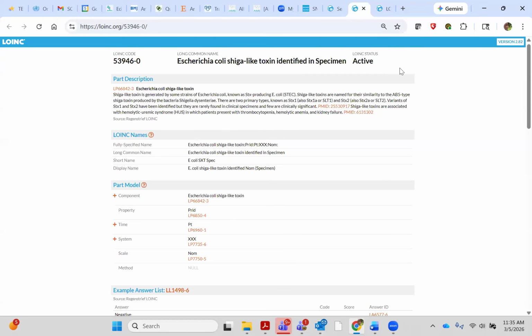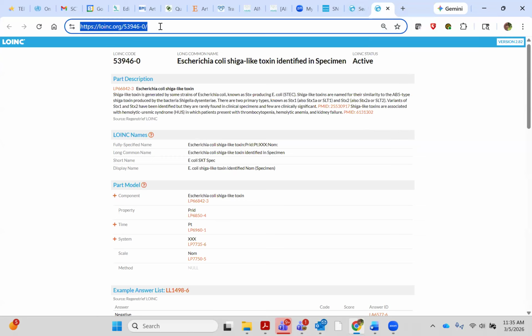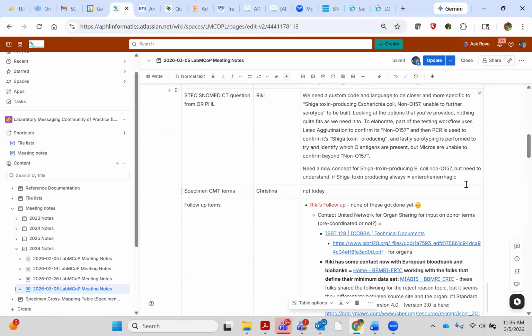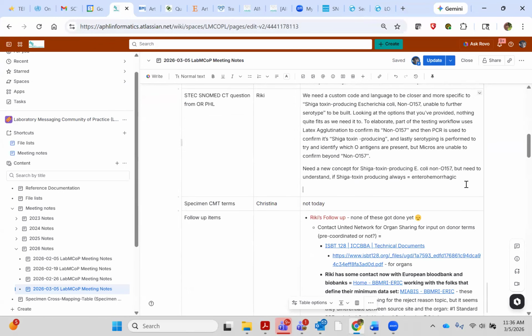Well, if we're not using it in the lab, then why do we have all the not isolated finding codes for organisms in SNOMED? Because there are people that do use it. You've got the specimen no bacteria isolated finding, an entire sub-hierarchy in SNOMED that has all these listed of what was not isolated.